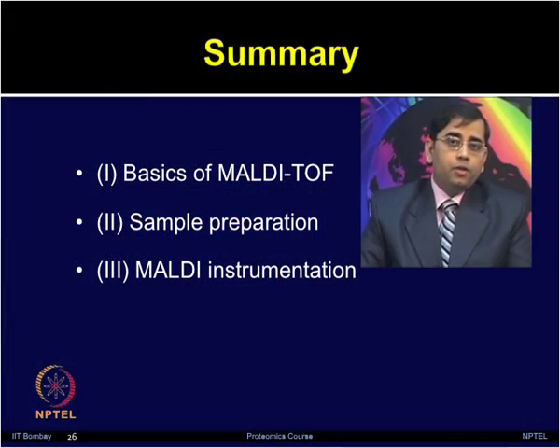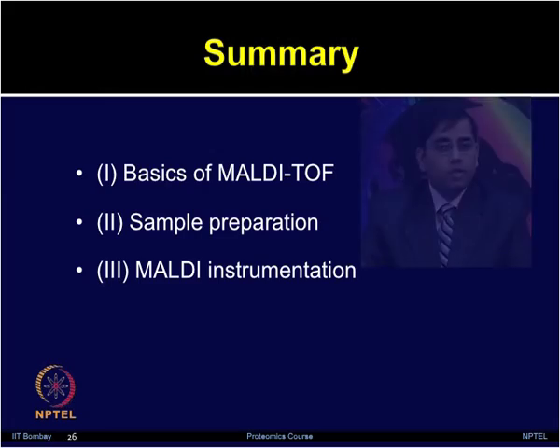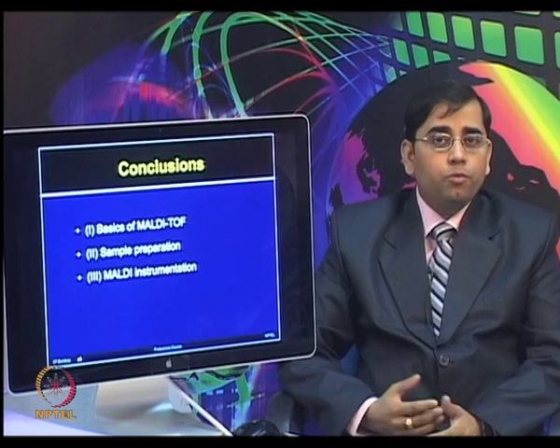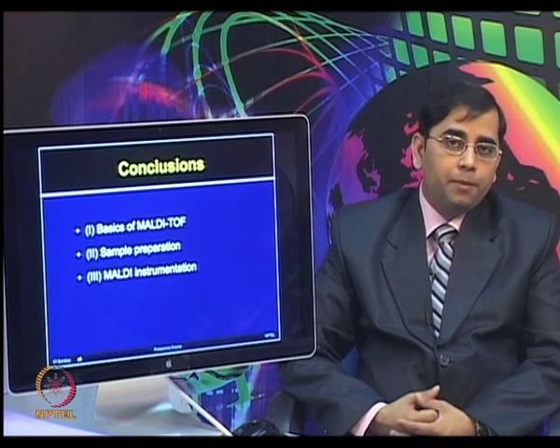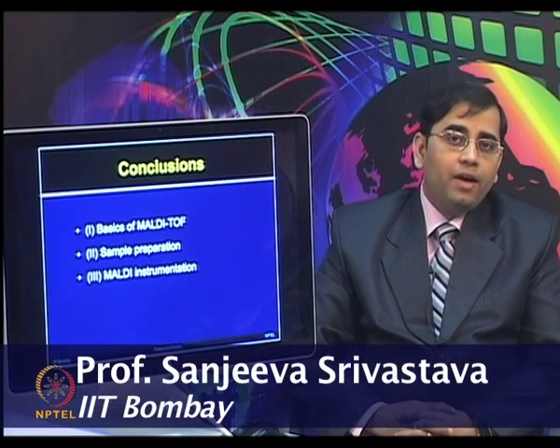So, in summary, today we talked about the basics of MALDI-TOF. We have also discussed the sample preparation, various steps involved including in-gel digestion, matrix selection, zip tipping, and after that, very briefly, we discussed MALDI-TOF instrumentation, and then we talked about how various types of hybrid configurations can be used to increase the overall sensitivity and various applications for proteomics.